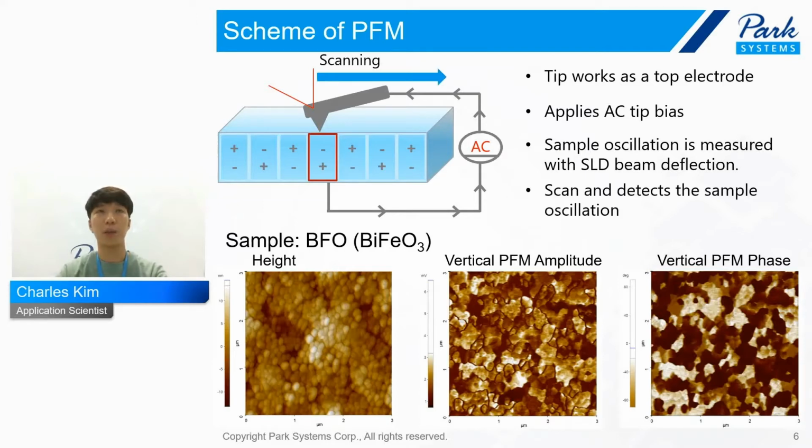And after that, if you move the tip position along the sample surface, then you can measure very small domain information or the piezoelectricity inside. So the bottom images are the PFM images. The first image is the height image of the bismuth ferrite.